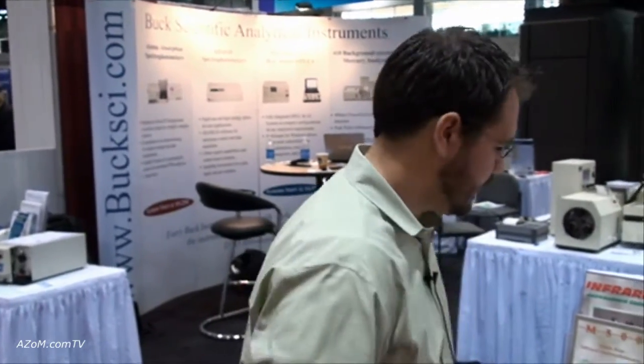This is Cameron Chai from azom.com and I'm speaking to Scott Bergeron from Buck Scientific, and he's going to show us through their infrared spectrophotometer. Thanks, Cameron.